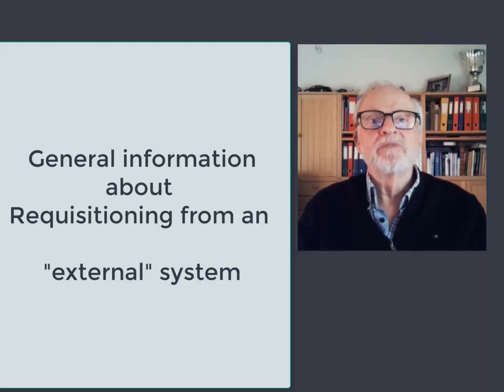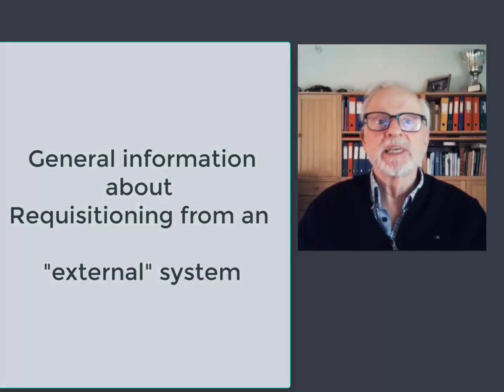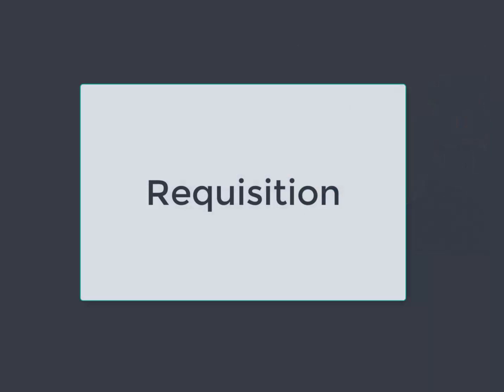We had emphasized that the system should be flexible. That is, it should be possible to make changes if the conditions surrounding the patient change, even if this happens relatively late in the patient treatment process. So let us look at the requisition.